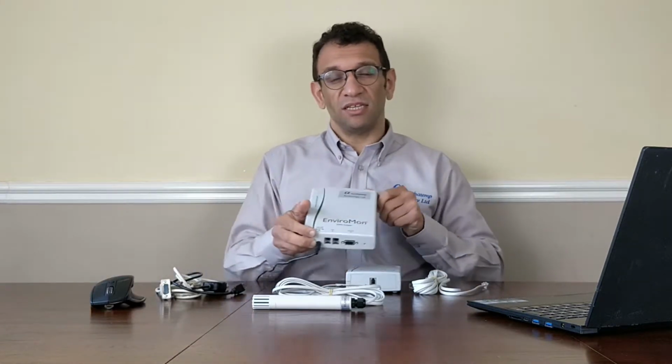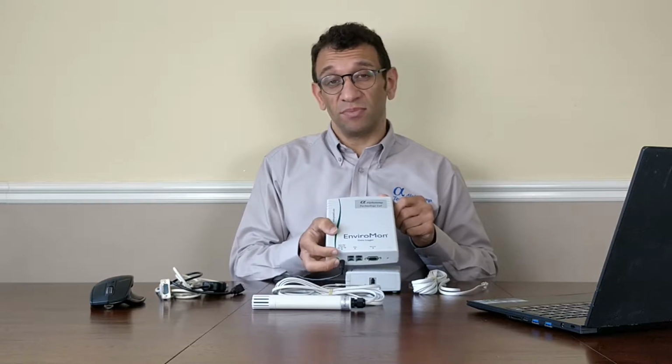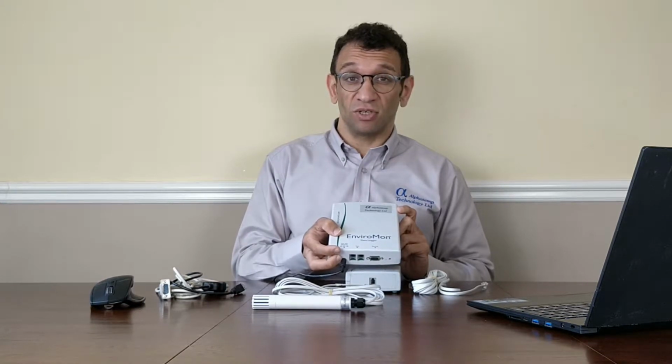EnviroMon guide. In this video we'll be going through the hardware and software configuration of the EnviroMon system. To do this we'll be doing a room temperature and humidity measurement. To demonstrate this we'll be using the EL005 data logger. This is central to every EnviroMon system and it's the interface between your PC and your sensors. It can be left to run remotely after initial configuration on your PC.